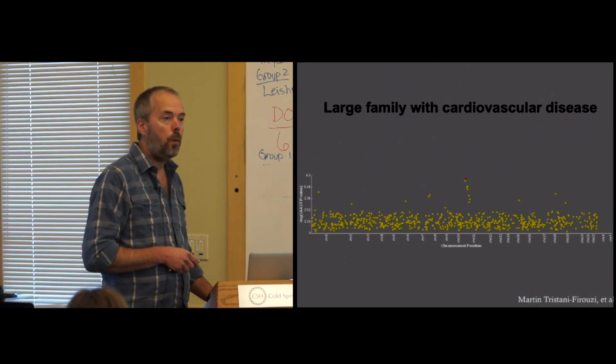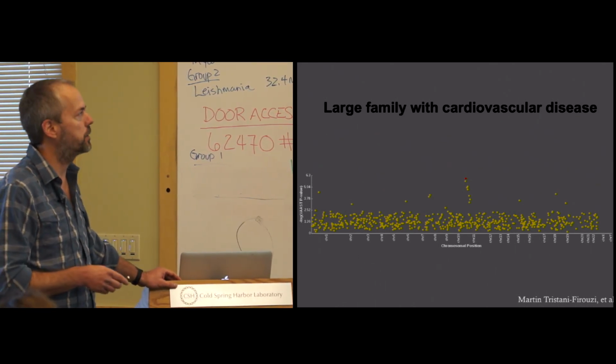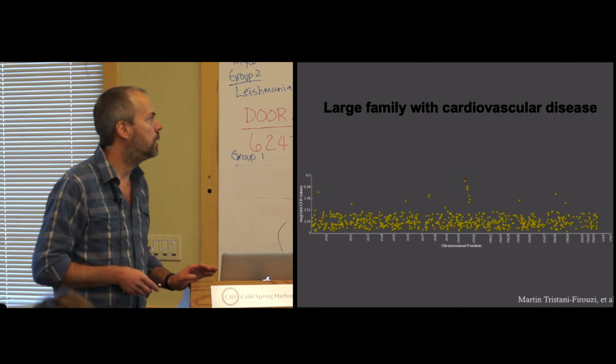It looks like in this picture though there are some other variants that are probably not pathogenic that are getting called along for the ride because they're linked. Because of that linkage, yeah. So this particular one shows quite nicely that linkage comet trail coming off that causative allele.